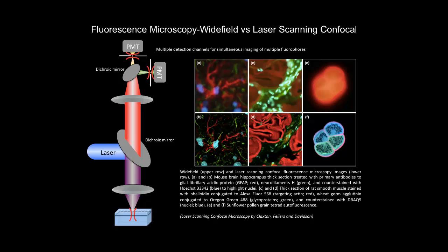So you split, let's say the shorter wavelengths, you let the longer wavelengths pass, and then you add another dichroic and split the emission signal farther away. So depending on the number of fluorophores, the way you arrange the dichroic mirrors and the ones you actually use will change. Exactly.